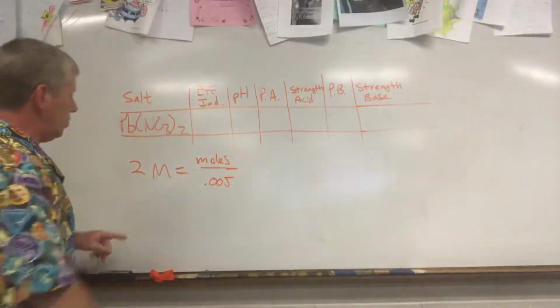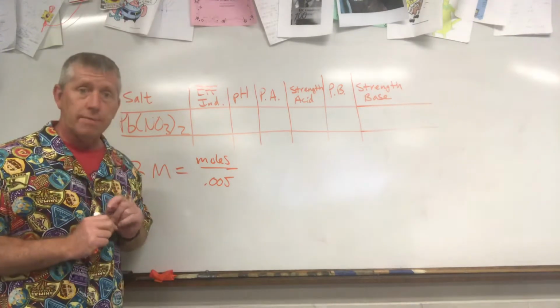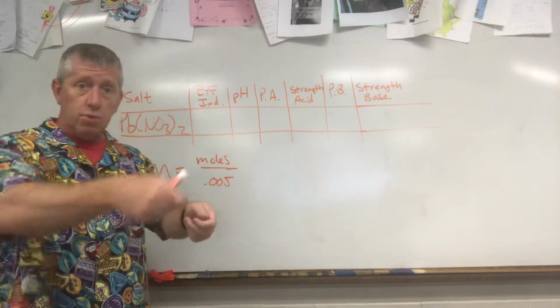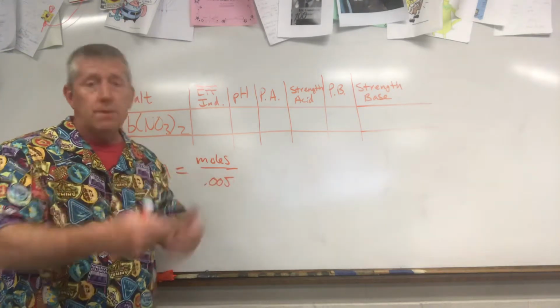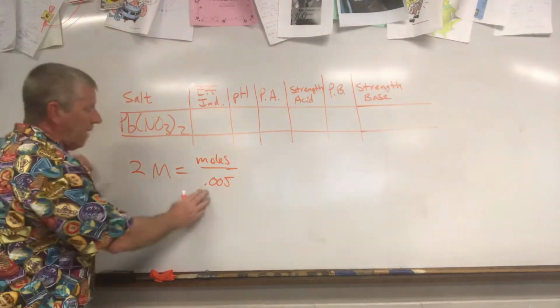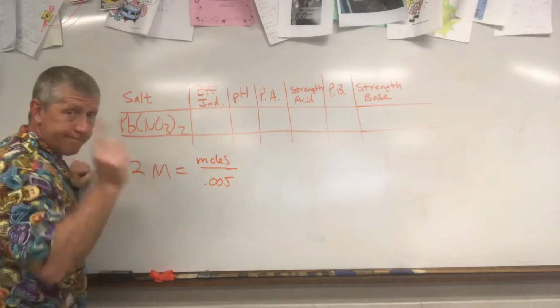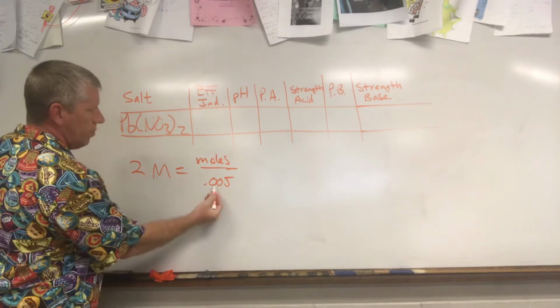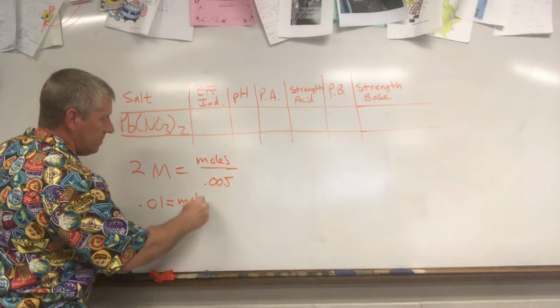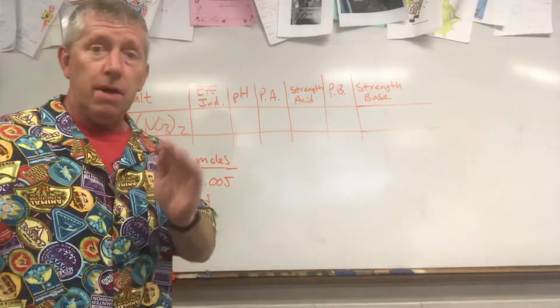And so for each one of the 7 trials, and each one of these 7 mole calculations, you are going to use this setup, because each one is a 2 molar solution, and each one is in 5 milliliters of water. Now, what's going to differ is how much of it you'd have to scoop out onto a balance and mass out. That's going to be different for every chemical. So for every one of the salts, all 7 trials, you're going to multiply these 2 to get moles. 2 times 0.005 is 0.01. So for every single trial, you need 0.01 moles of the salt.